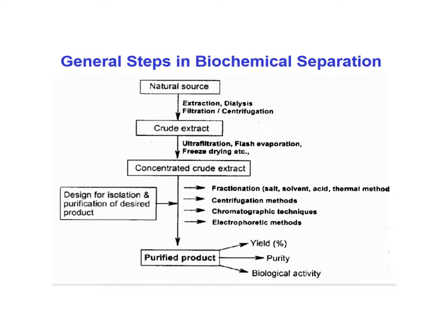Where we would like to go is, once we have an organelle, we would love to figure out a way to mimic that organelle's function and activity in a cell. It's called a cell-free system, and we will touch on that coming up as well. So that's an overview, the general steps in a separation, and we'll see these things again.